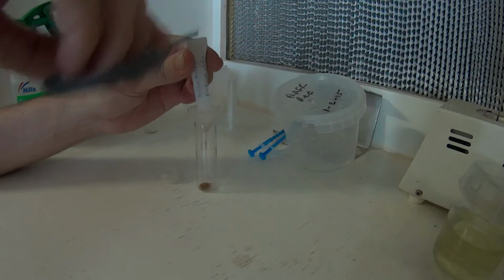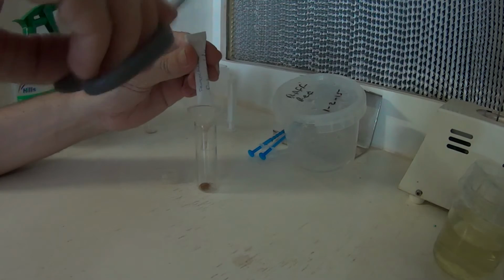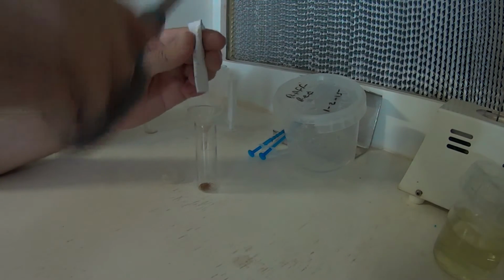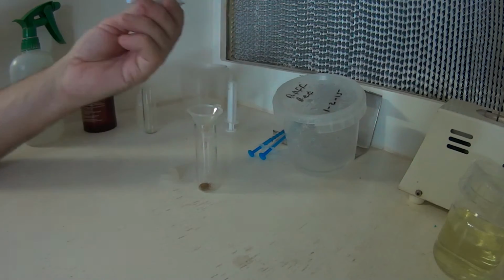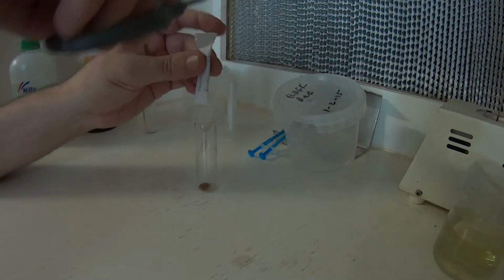I like to spray everything down in here with alcohol just to sterilize it a little bit, but it's no big deal at the moment. We just need to get the seed in there, or spore. So I think that's about it. We've got most of it in there anyway.